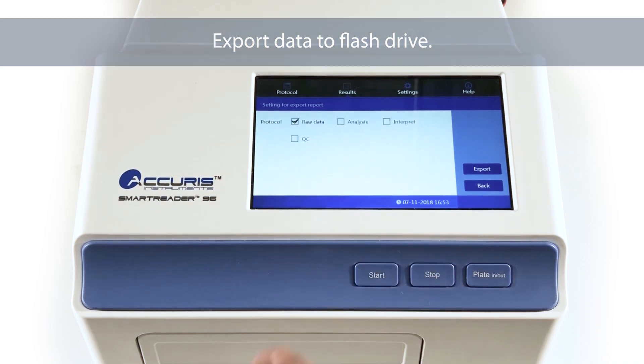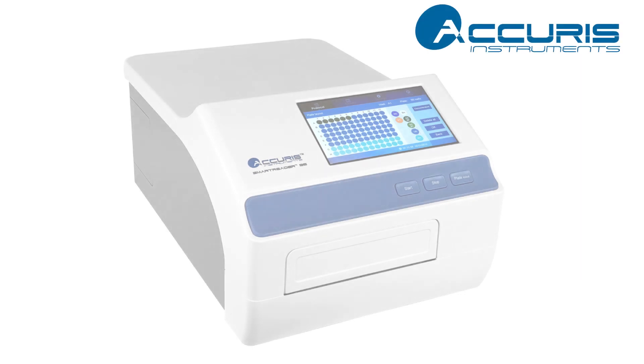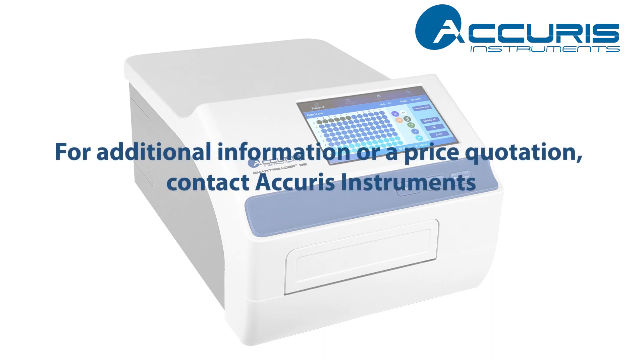The data is exported as a CSV file that can be opened and further analyzed in Microsoft Excel. The SmartReader 96 is a compact, easy to use, and economical absorbance reader that will be a welcome addition to your lab. Please contact us for additional information or a price quotation.